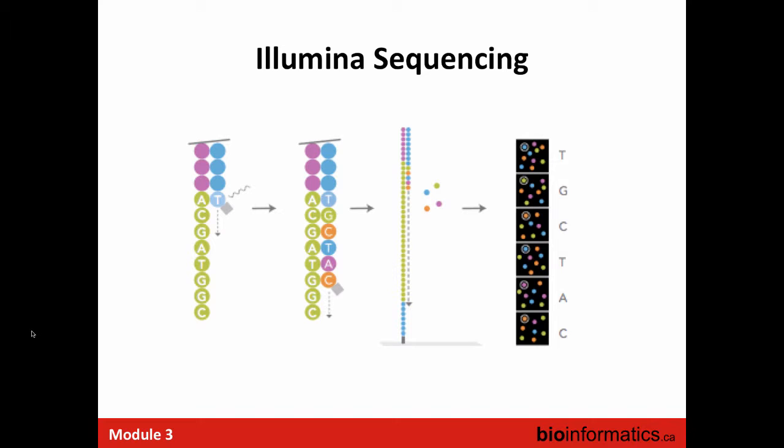Can you elaborate on that concept of amplification? Yeah, so you have a DNA molecule, and on the surface of the flow cell, there are adapter sequences. The DNA molecules come in, they bind to the adapter sequences, and then one strand of the DNA gets cleaved off, okay? And then the DNA is sticking up vertically on the flow cell, it bends down to another adapter that's complementary to the other half of the DNA, and then there's what's called bridge PCR that happens, where that bent molecule of DNA gets progressively amplified into a cluster.